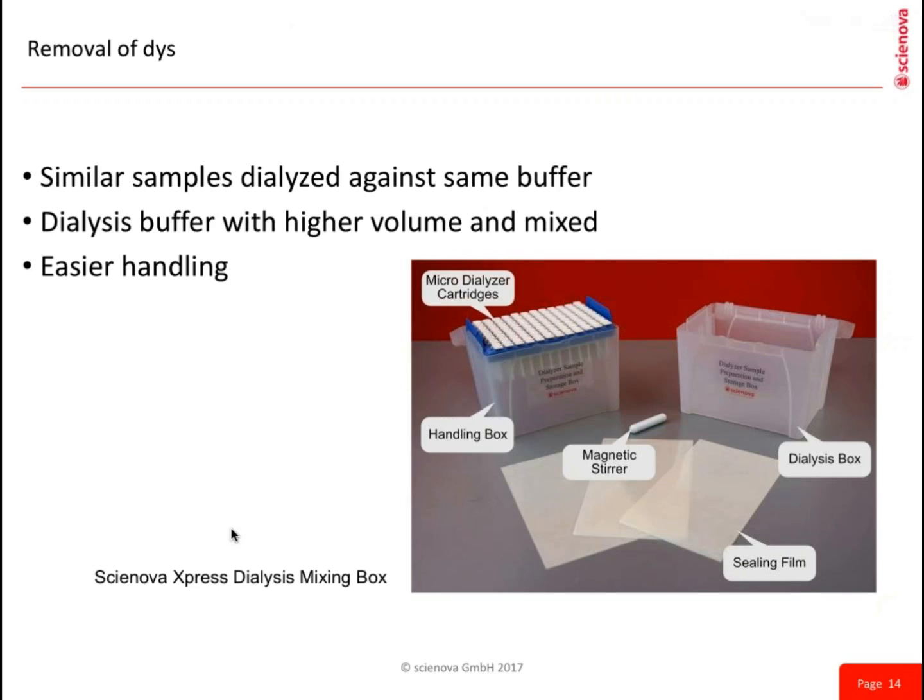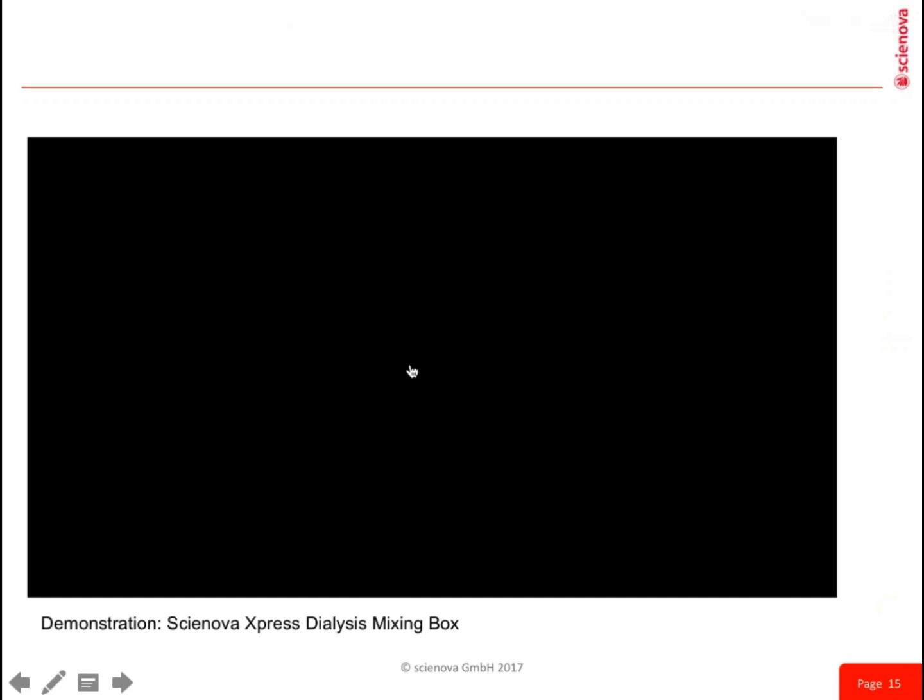If you use the same samples and the same buffer and you want to dialyze it, you can use this system, and you can save handling time. And I want to show you a short video where you can see how it works.